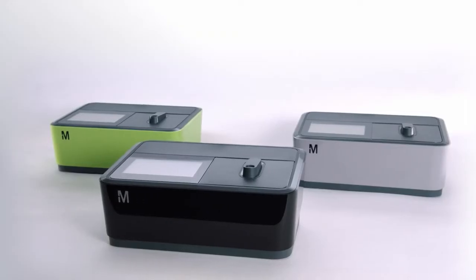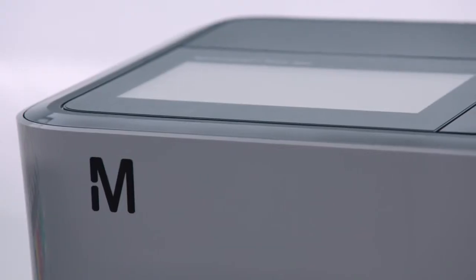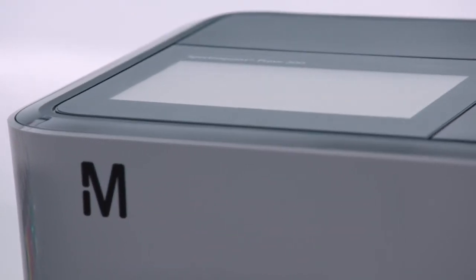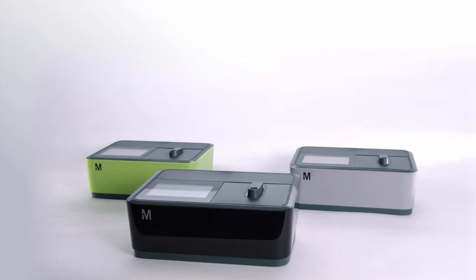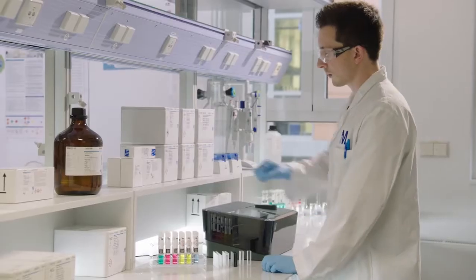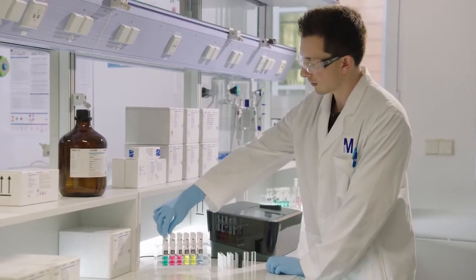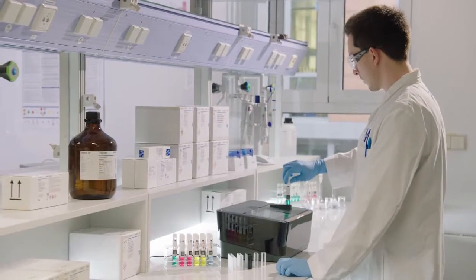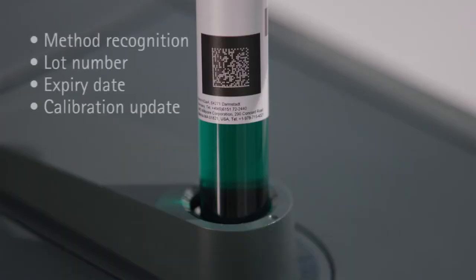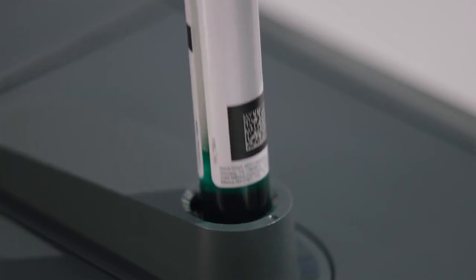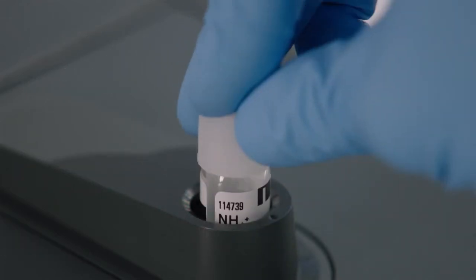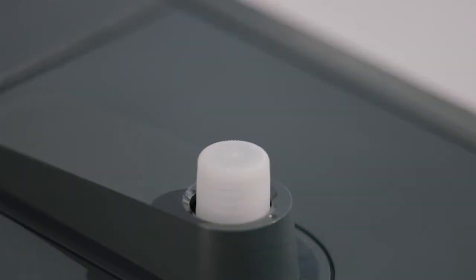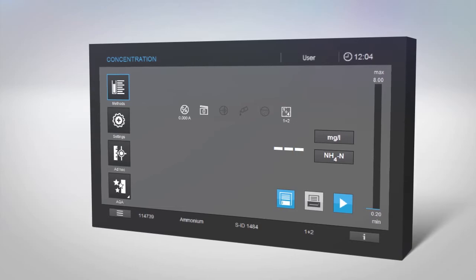When used with SpectraQuant Prove, the system automatically selects the correct analysis method in the instrument. All important information regarding lot number, method selection, expiry date, and calibration updates are provided on our new LiveID barcode. Match the white line on the label with the dot on the cell port. The measurement will start automatically.